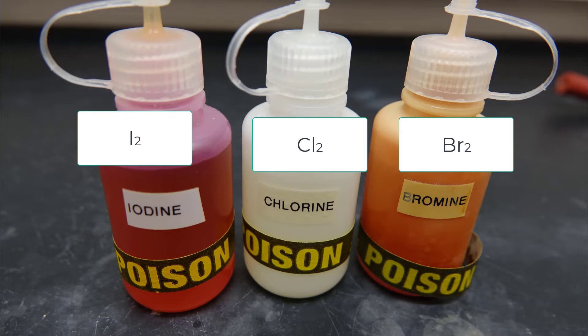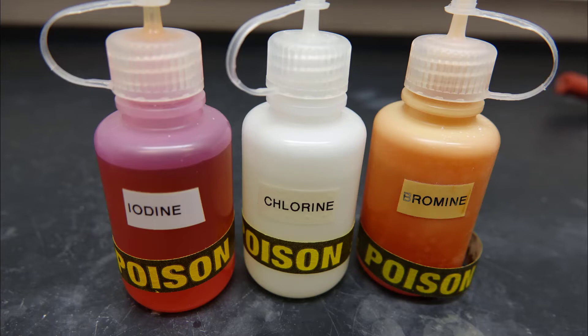Make sure to know which halogen is which color. The iodine is pinkish purple, you can see that up at the top. The chlorine is pretty colorless and the bromine is orange.